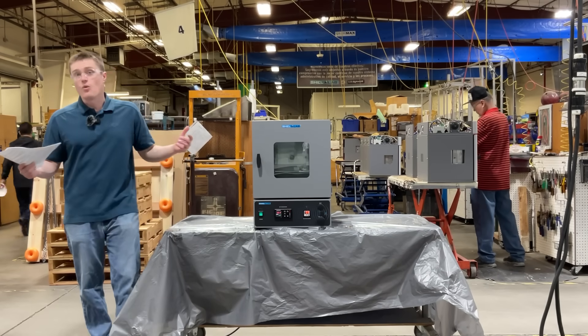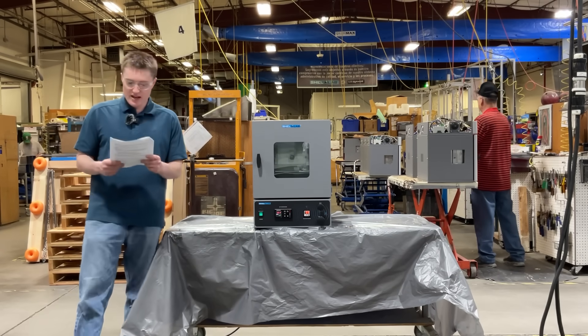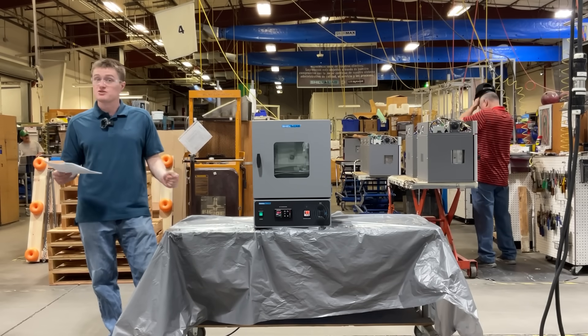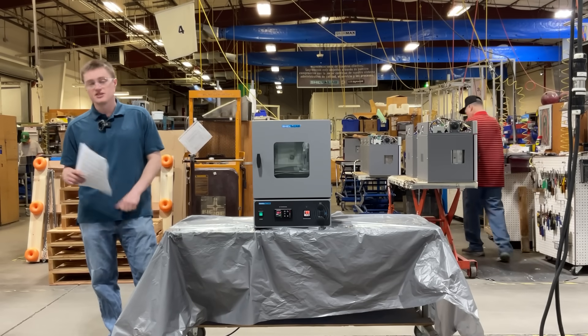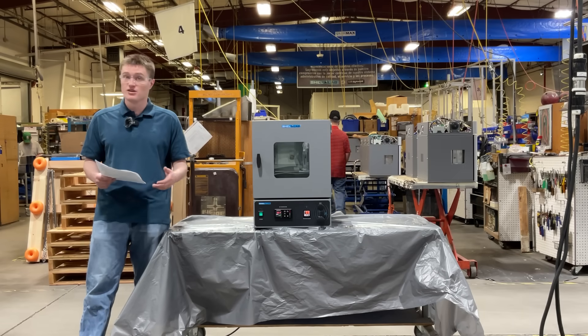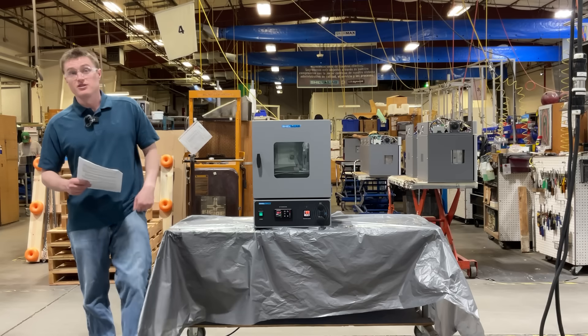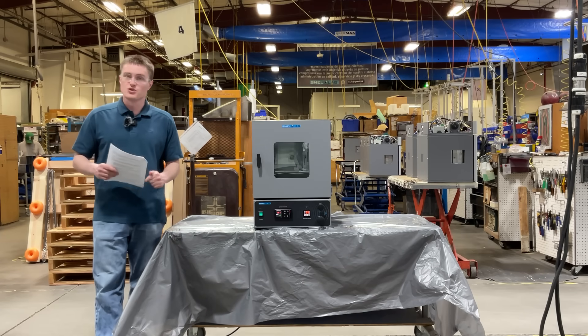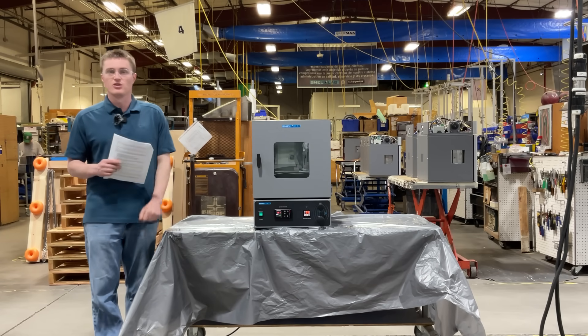The SVAC-1 bench top vacuum oven is designed for research labs, industrial applications, and production environments that require uniform, contamination-free drying and processing. Whether you're working in biotechnology, aerospace, nanotechnology, or electronics manufacturing, these ovens ensure controlled and repeatable conditions for critical processes.